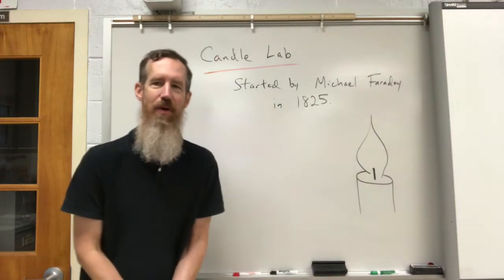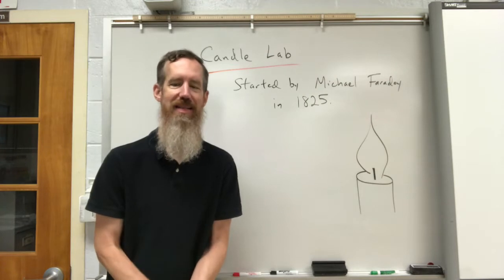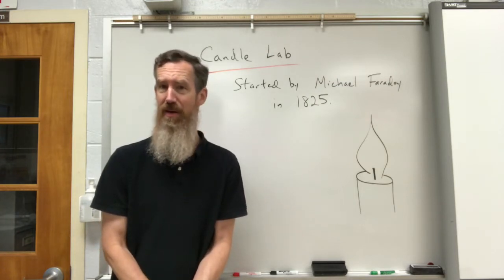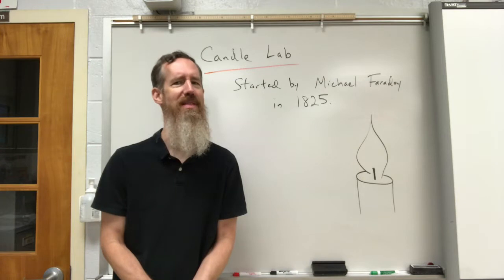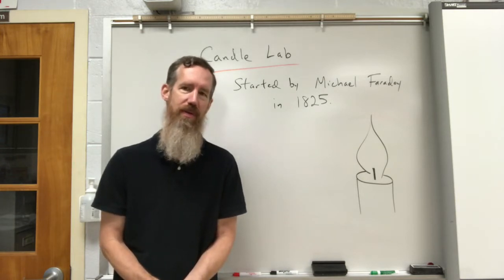Okay, we are going to embark on a classic chemistry exploration, the candle experiment, or the candle lab. We're going to burn a candle and we're going to watch it. It doesn't sound terribly exciting, but we're going to do some other fun things with it.